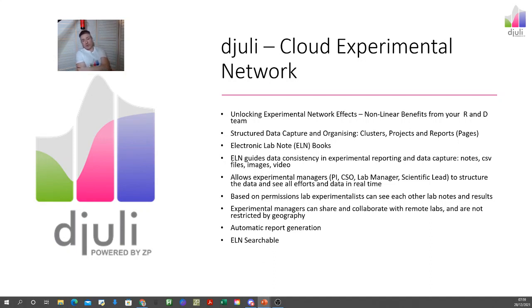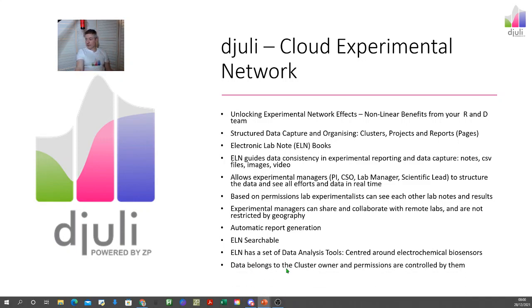This is really important, that the reports are searchable. Many file document systems are fine, but it is sometimes hard to retrieve experiments that you might have done 2 years ago. So the ELN system is searchable, and though I'm not going to dwell on it in this particular video, the ELN also has data analysis tools so that you can turn raw data into data through filters and smoothing, etc. But I'm not going to dwell on that today.